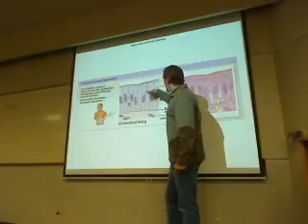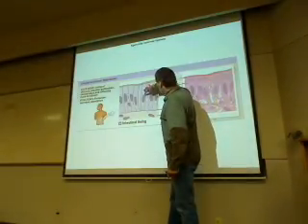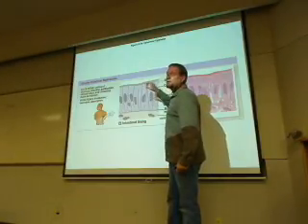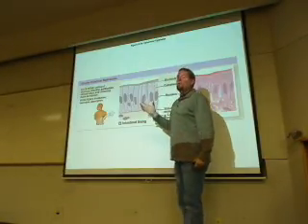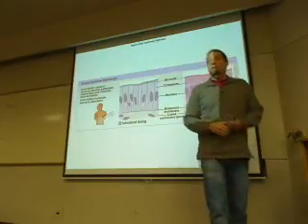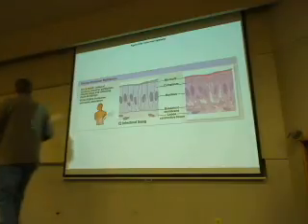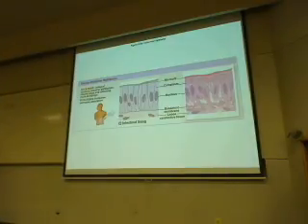So goblet cells would just be between these cells. Where you saw a goblet cell and the adjoining columnar cells, they would be held together by tight junctions. Their purpose is to help with absorption or to produce mucus. And that helps? Is that helpful for some reason? Yeah, because if we didn't produce mucus, don't hold me to this one, because I read this a while back and I'm going to figure out where I saw it.